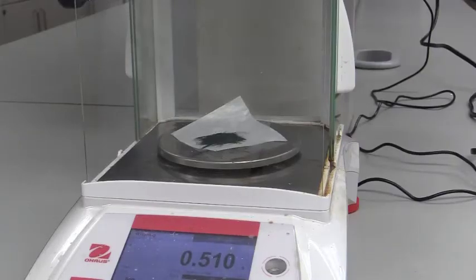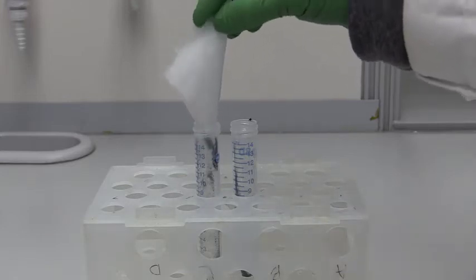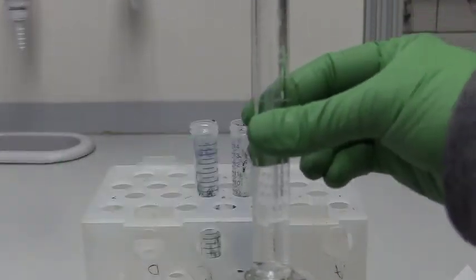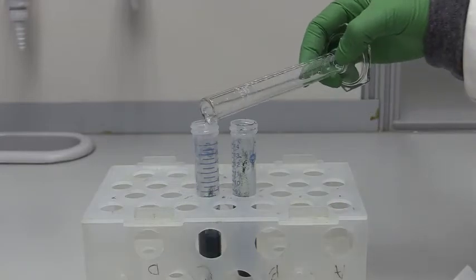I first started out by weighing out the spirulina, about 0.5 grams, and this was distributed into two different centrifuge tubes. Then I tried to put them evenly into the two tubes, and then 7 mils of phosphate buffer was poured into each of the tubes. The pH of the phosphate buffer was 7.